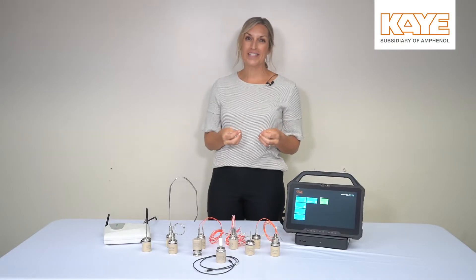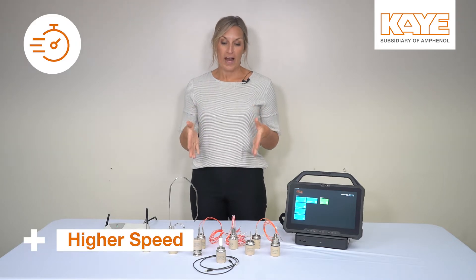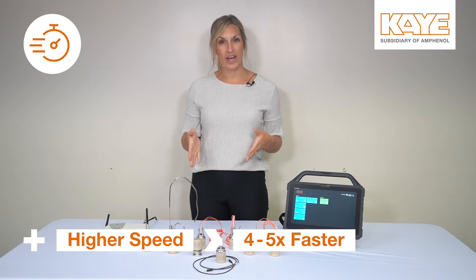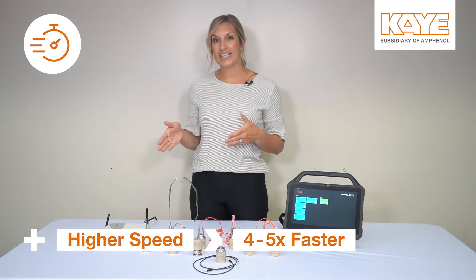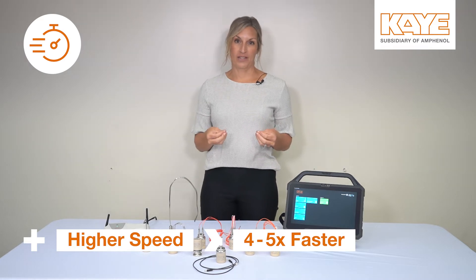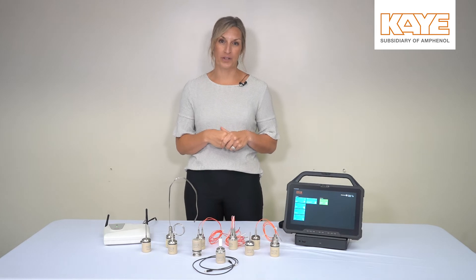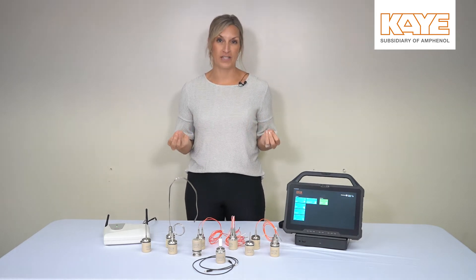One of the biggest enhancements that every user will notice is the speed. Now when you program your loggers, they're going to program four to five times faster than they're already programming. And also when you're done collecting data, the downloading process is four to five times faster. So this is going to save you time before and after each study.